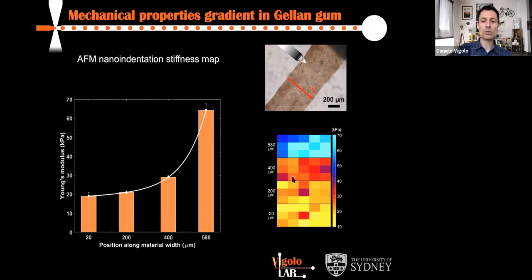By doing so, we see that the profile follows exactly what is expected from the theory of thermophoresis, an exponential decay. So this is the distribution that the concentration will have, and we know that the concentration is directly linked to the stiffness, so we can monitor that what we are actually looking at is the same thing.